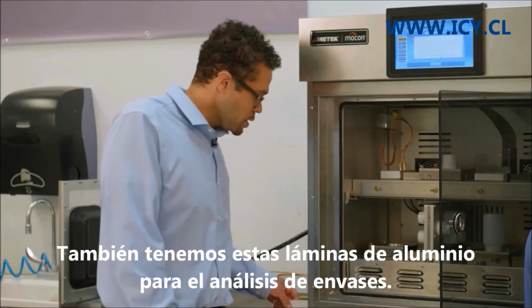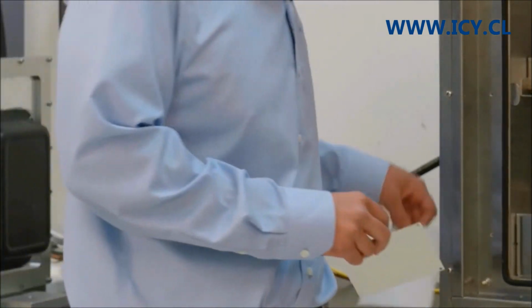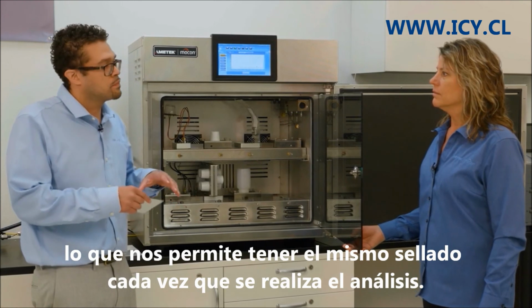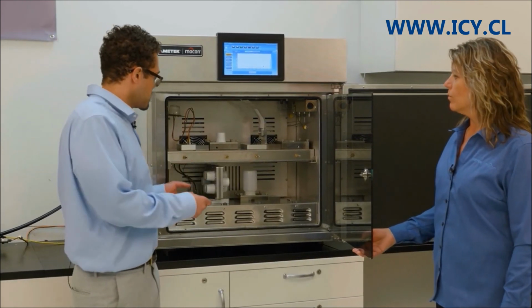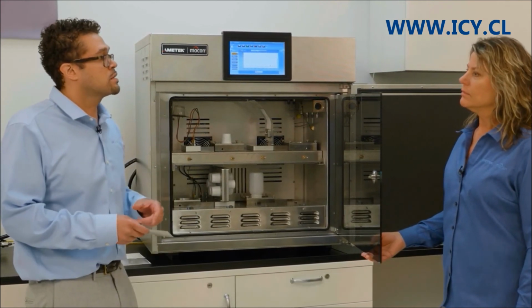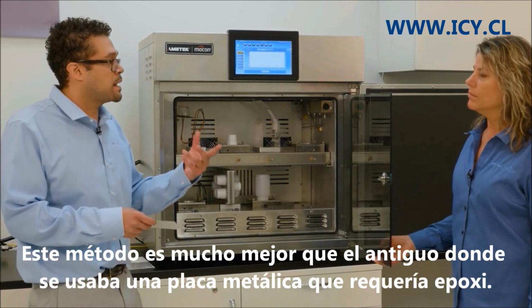And also, we have these pre-cut foils here for testing packages, which allows us to basically have the same seal every time we go to test, because we'll seal this within a cartridge and place it, engage it in the instrument. And this is better than a plate. Nice. As we're used to doing because of the epoxy issue. Exactly.